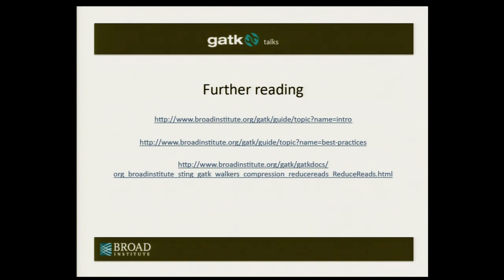And in the variant region, you still have all of the reads there. So it's basically the same thing as running on the original BAM. So most of the metadata looks the same. We have done extensive analysis on all of the metrics that we use for calling, things like haplotype score, mapping quality, base quality by depth, all the values that we use for filtering evaluation.